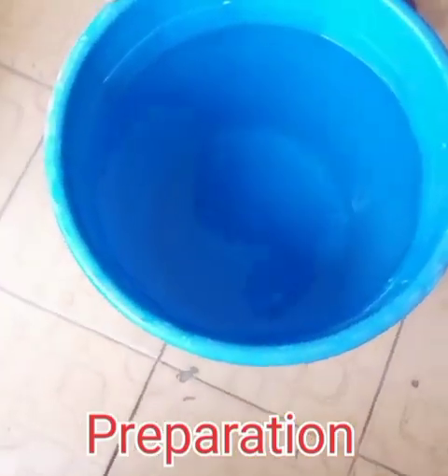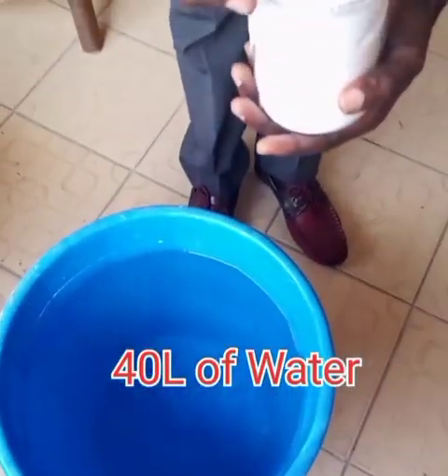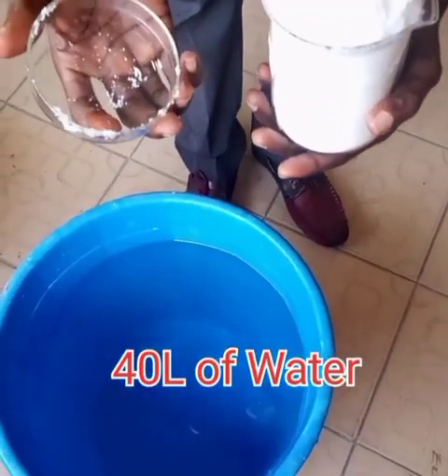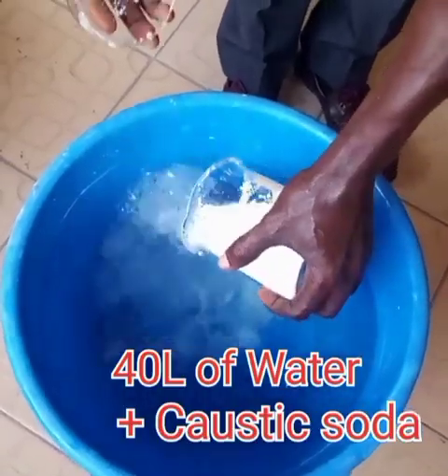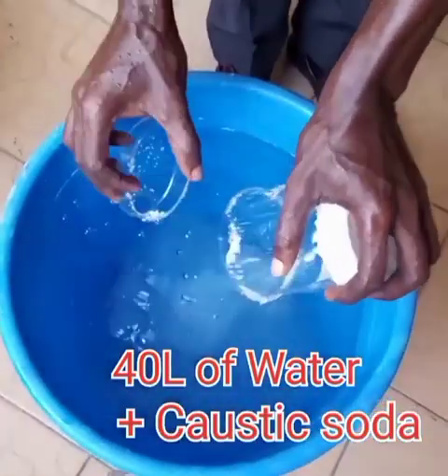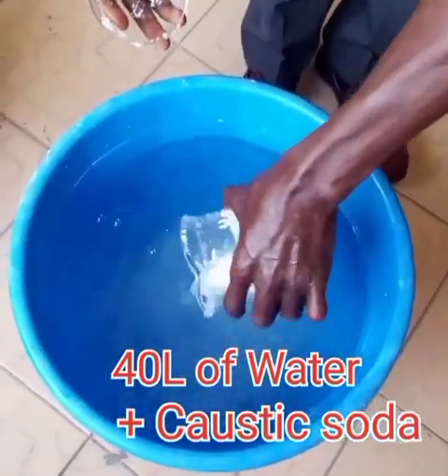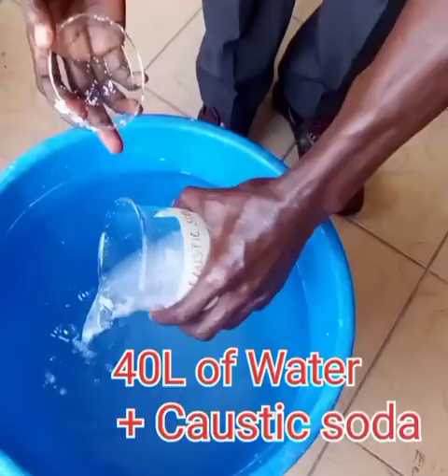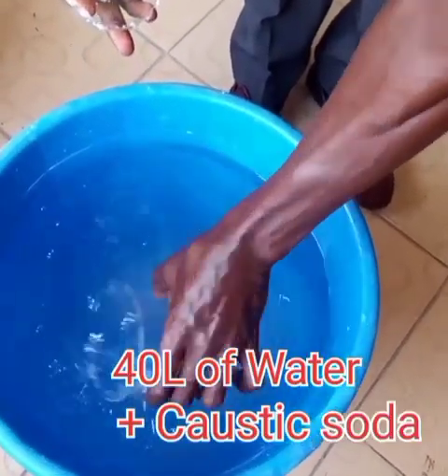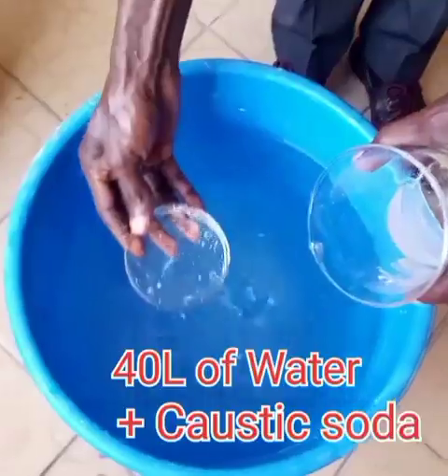Alright, we are going to start the preparation. This is 40 liters of water. You measure 40 liters of water into a vessel like this. First, we are going to dissolve the sodium hydroxide in the water, then allow it to cool. This is sodium hydroxide, that's the caustic soda, 1 kilogram. So I will add it to the water.